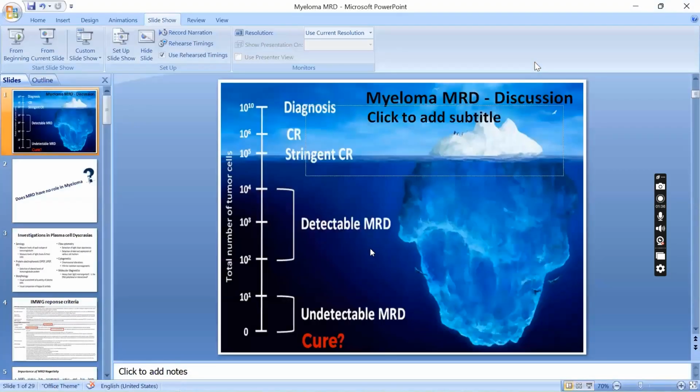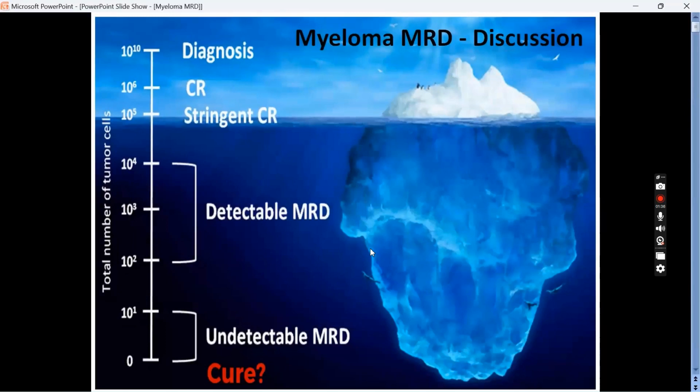Sir, for LOD, should we start with 1% dilution or any spiking? How much should we use? You can, if you want, start with 10%. For example, you have an acute leukemia case where the blast is 30%. From 30%, you start with 1 in 10, which becomes 3%. Then another serial dilution, 3 becomes 0.3, then 0.03, 0.003. So you can start with something like that.